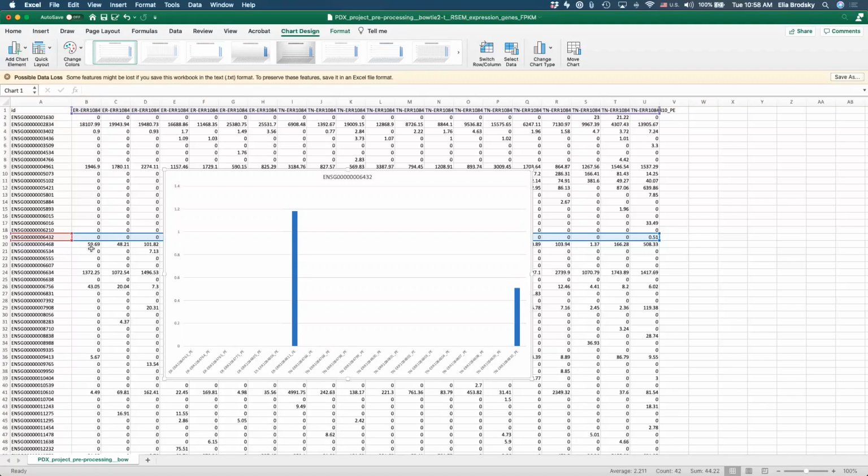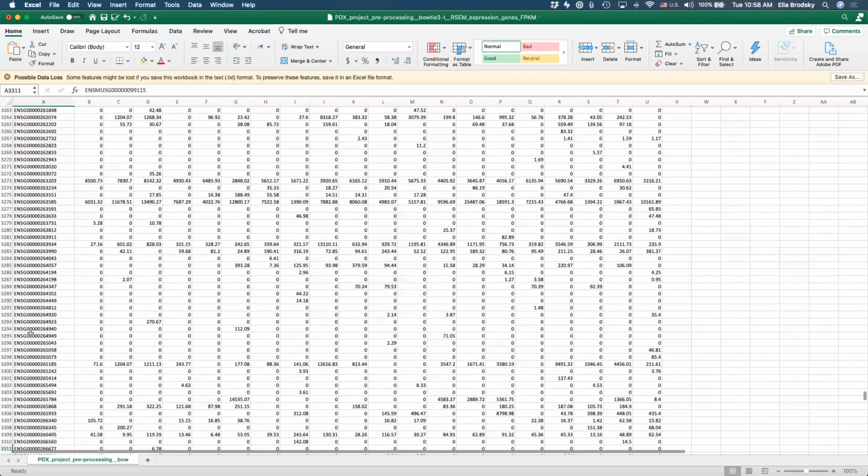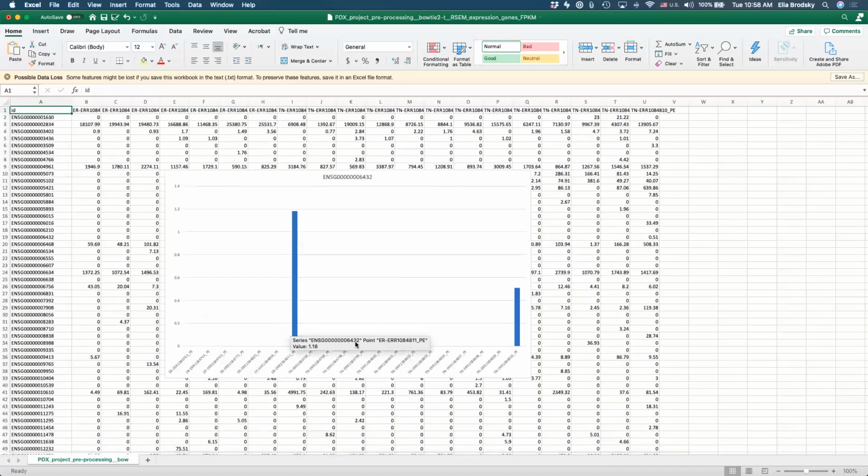Okay, as you're thinking about it, he's saying it depends on the data set, maybe a 0.6 difference is significant. Okay, so that's a good point. So let's take a look. How many genes do we have in total here? If we scroll all the way down, we have over 3,300 genes. And out of those 3,300 genes, we find one gene that looks like this. It is below 1.2, right?